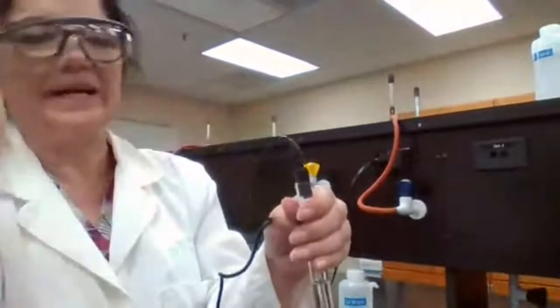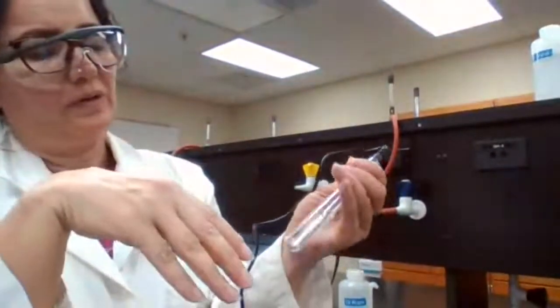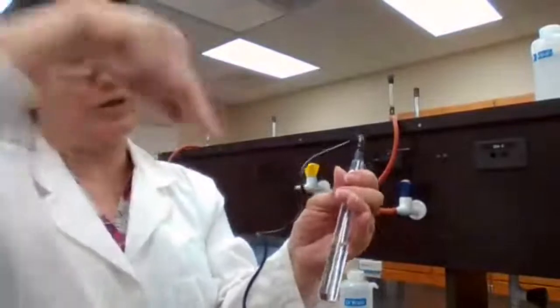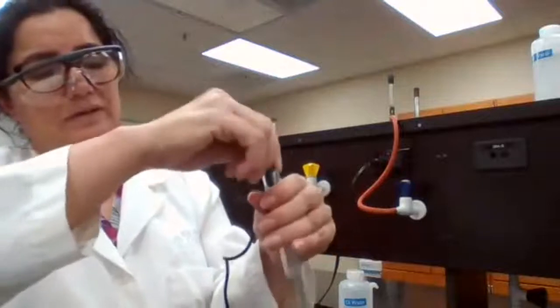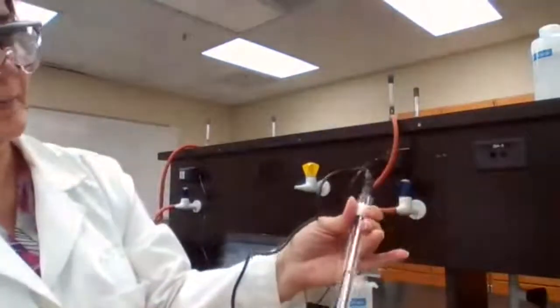If it was like a straight line, we could have said exactly what temperature, but by the two that we have, trying to extrapolate, we don't know if it's a straight line or a curve. So we have to wait for the experimental value until we see the crystals.